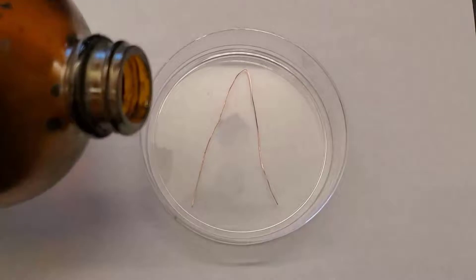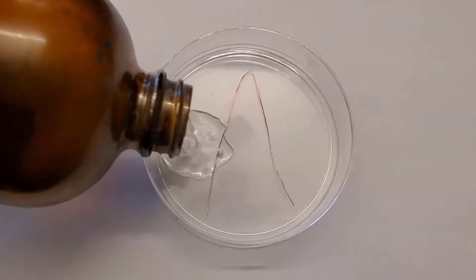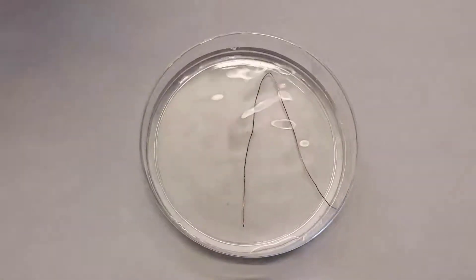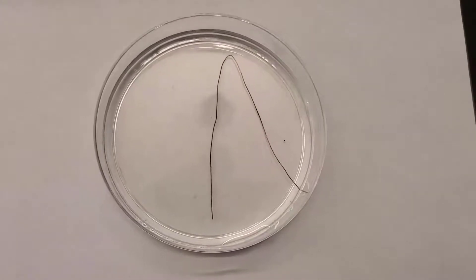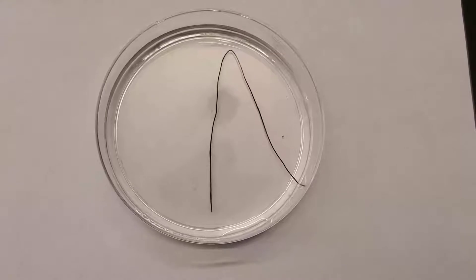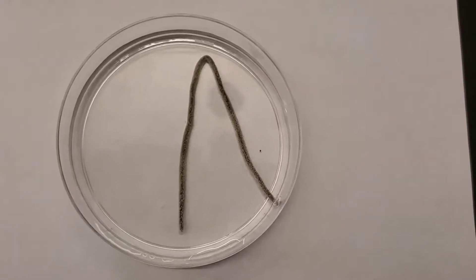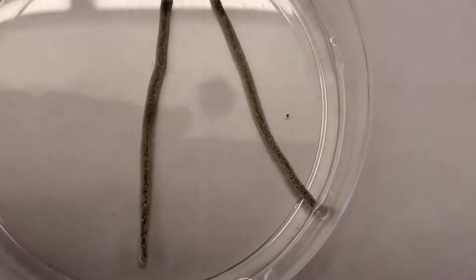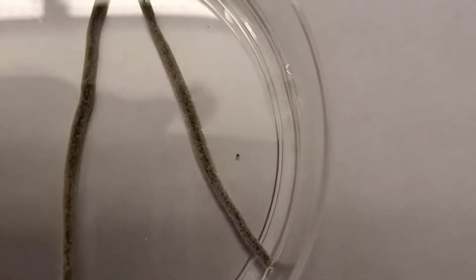I'm gonna go ahead and pour some silver nitrate over the top and now we can watch the magic. Not that exciting, but wait — I'll come back in a moment. Okay, now it's starting to look a little thicker and looks dark. Let's see if I can zoom in a little bit.